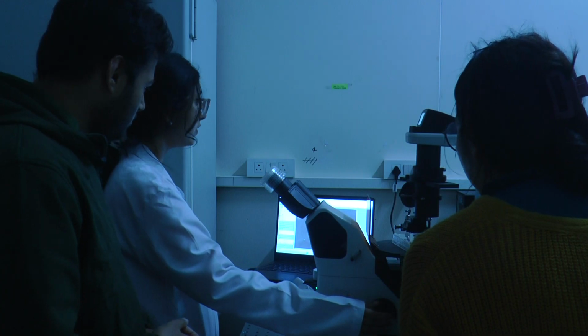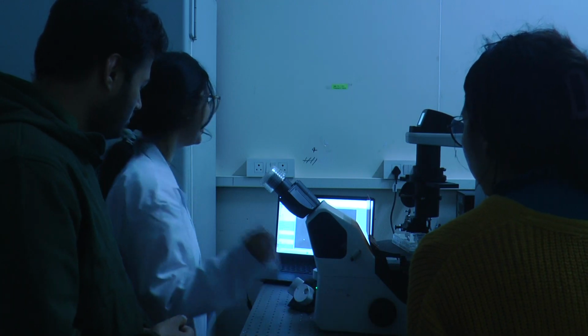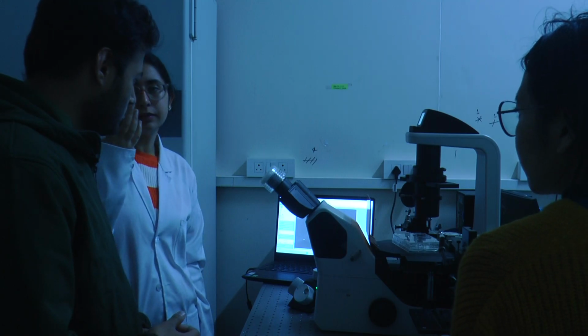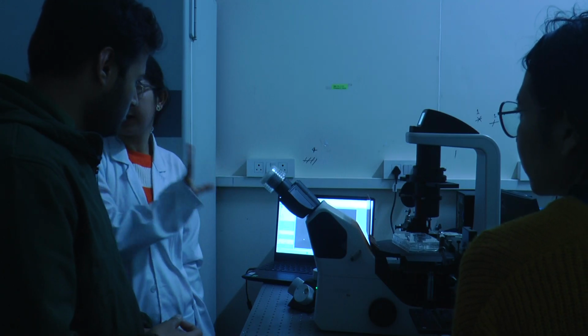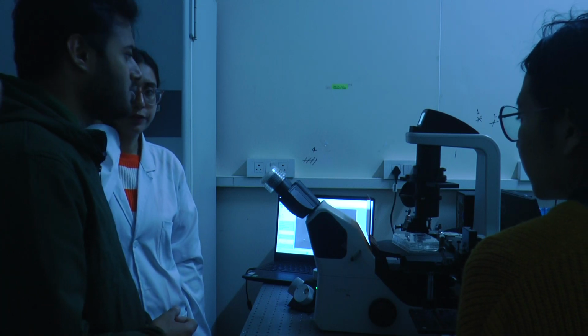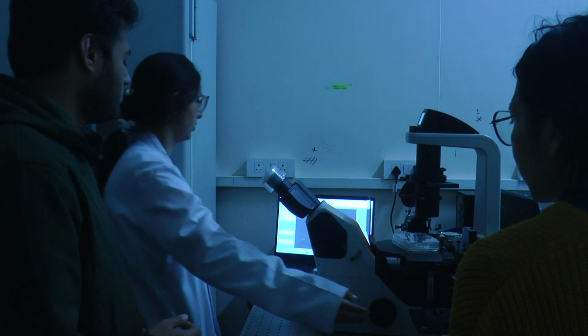With GUVs we get 50, 60, 70, 80 microns also. And with this method, I am getting a max of 20 microns, so 5 to 20 microns.